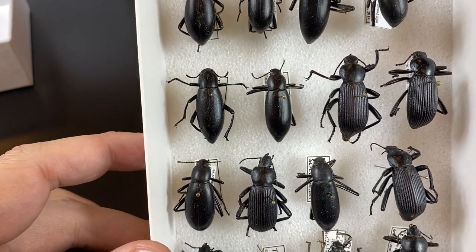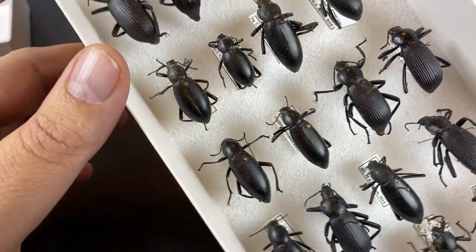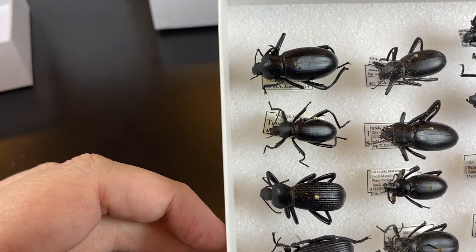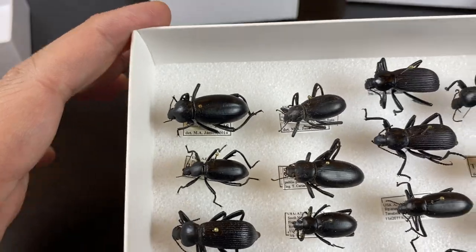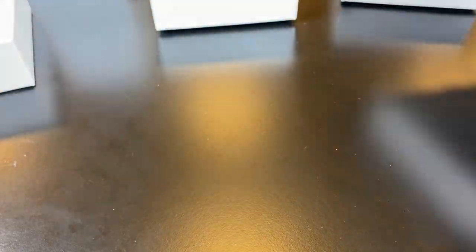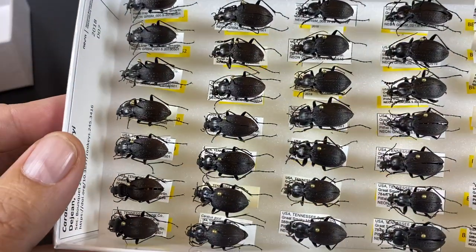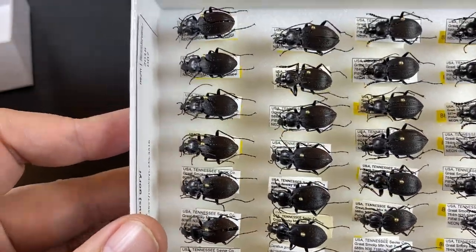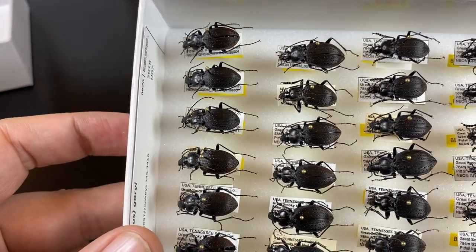These are just three things we want to think about when pinning insects. In future videos, we'll talk about tips and techniques for pinning beetles so that they look as nice as possible, are practical without taking extra time, and will be well preserved for future generations of scientists to use.